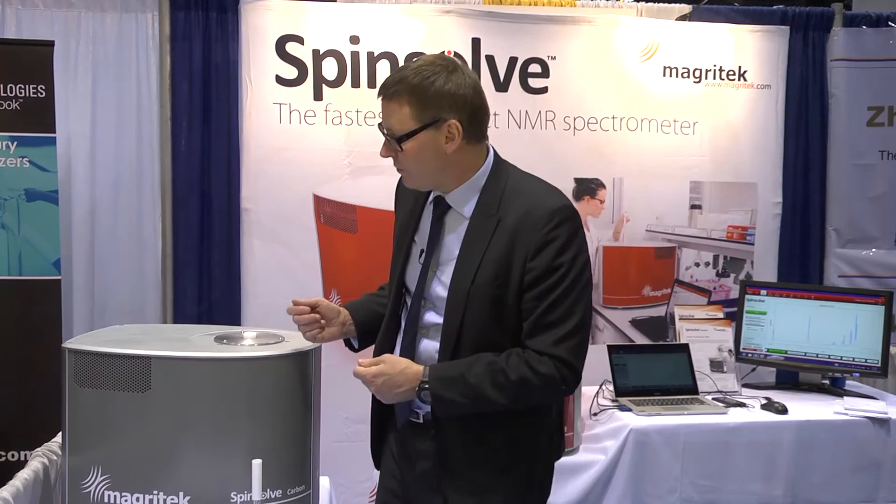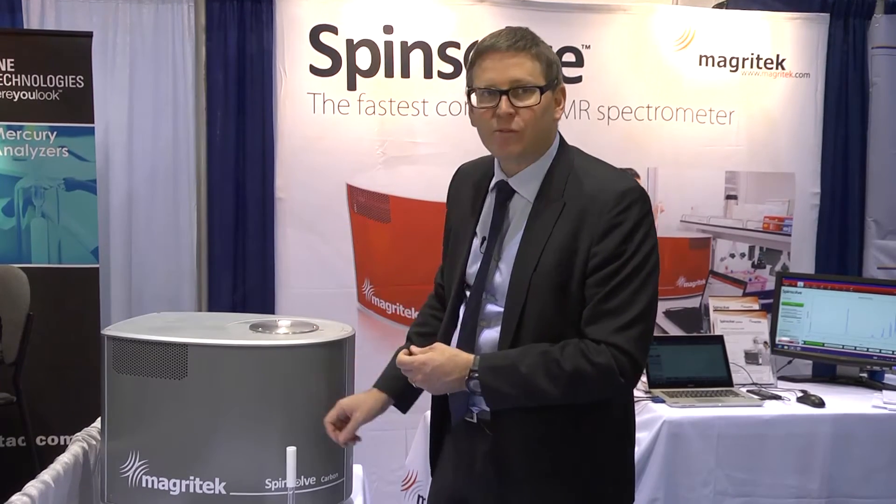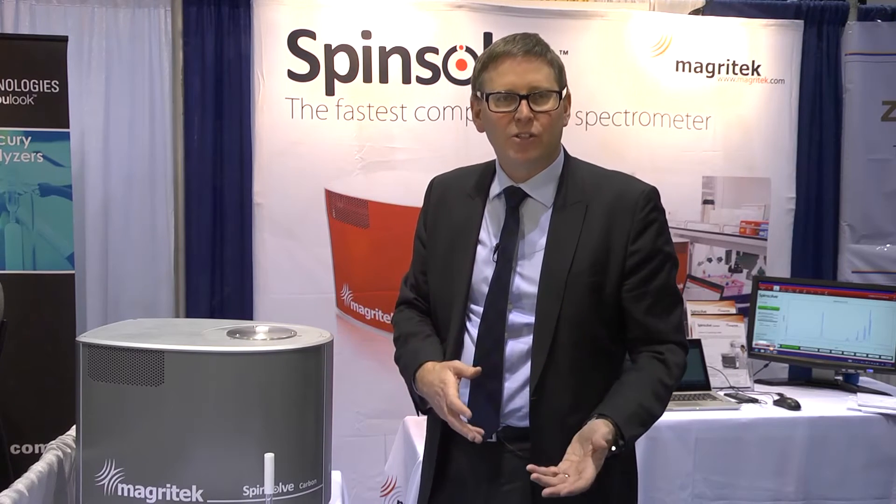One of the other features of SpinSolve is that the bore of the magnet goes all the way through from the top to the bottom. So you can also pass a tube through there and set it up in a continuous flow reaction monitoring setup to monitor your reactions online as they're progressing.